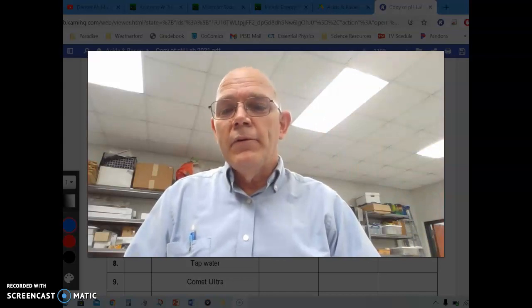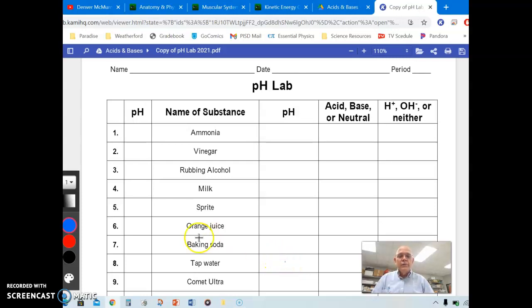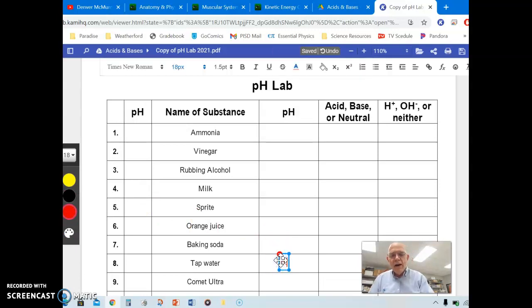I'm going to minimize this, and we'll go down here to number 8, and we will type in the pH. I will get on the text box tool over here, then type in the pH, and we're going to call it about 6.5. This is just an approximate value, so let's go ahead and make it 6.8 because it has a fairly good green color, a big blotch of green in there. So we're going to call it 6.8, so almost 7.